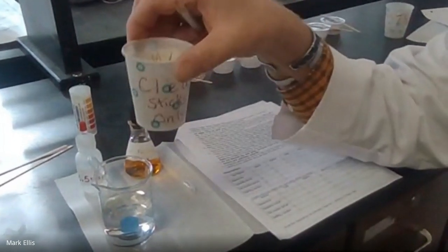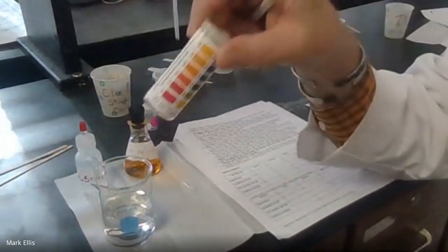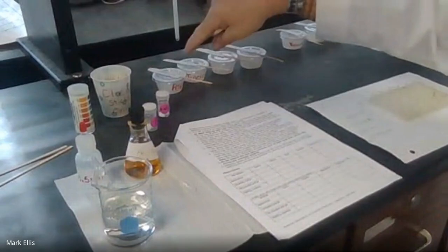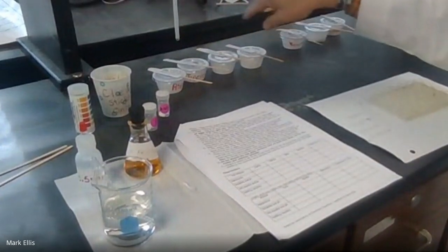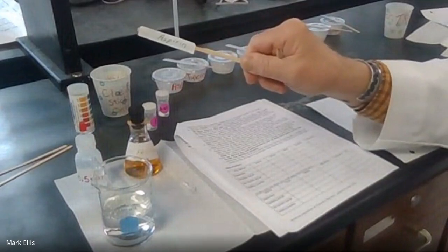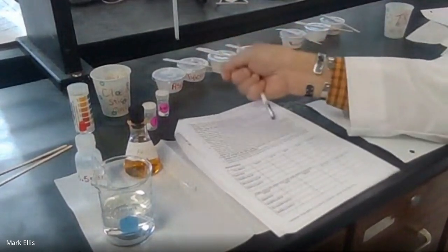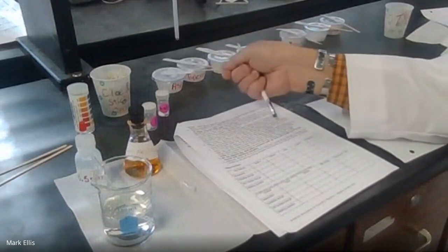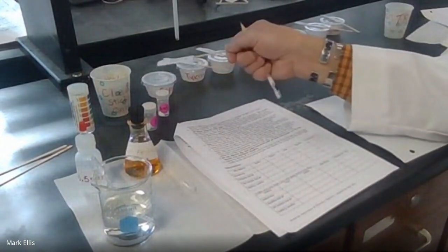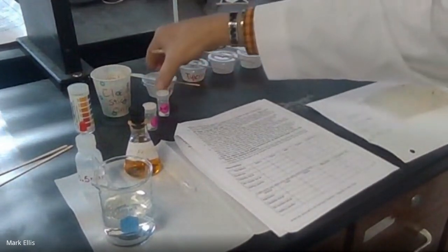Clean toothpicks only. Do not put the dirty ones back in here. Got pH strips. We could tear these in half and double them. All of the pain relievers and the antacids have their own spatula labeled. Use only the labeled ones with that substance. Do not cross-contaminate. Another good rule, if you take a cap off, put the cap back on. Do not leave all these caps off, and then there's a good chance of cross-contamination.